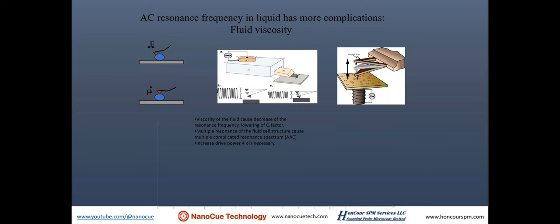And then we could use a cantilever that is coated with magnetic material, and using a solenoid coil, drive an alternating magnetic field, causing the tip to oscillate, and then use this oscillation to do basic tapping. It's what we call MAC mode. That has a certain benefit of imaging something that's very soft.